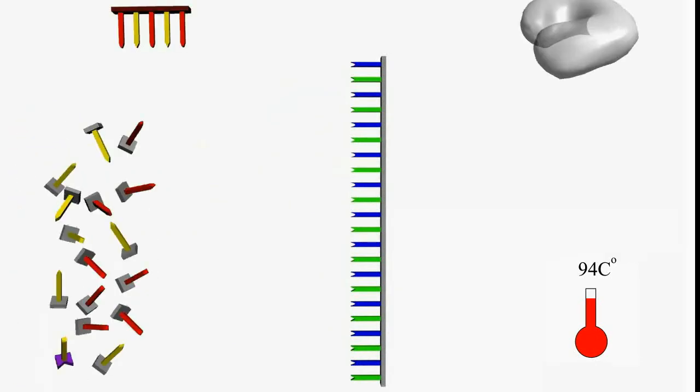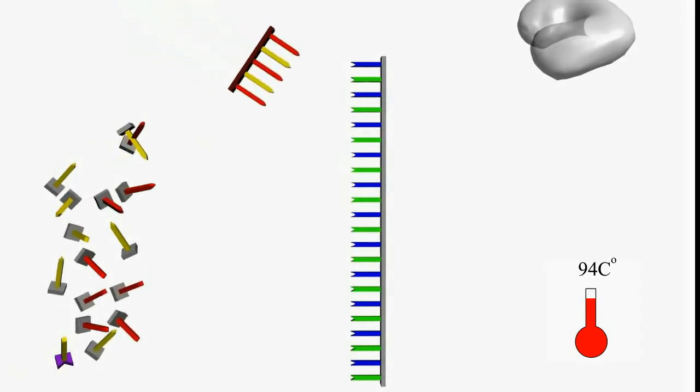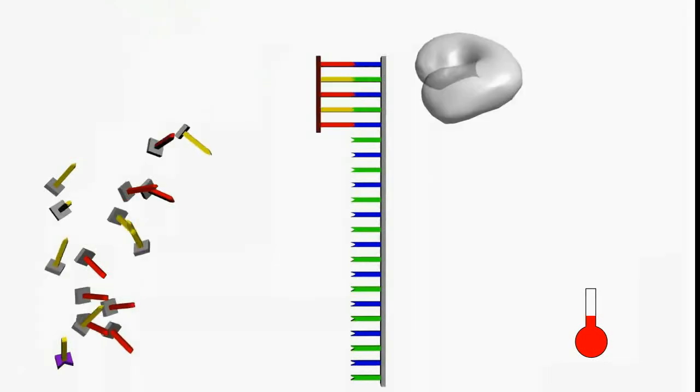Then, the annealing step starts, where the temperature is cooled down to approximately 50 degrees Celsius. This is where only primer strands can anneal. Now, the primer is wriggling around until it finds its complementary strand and combines with it. Once there are a few bases built in, the ionic bond is so strong between the template and the primer that it does not break anymore.